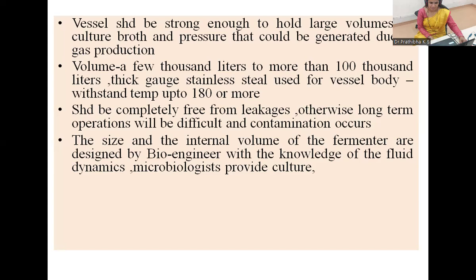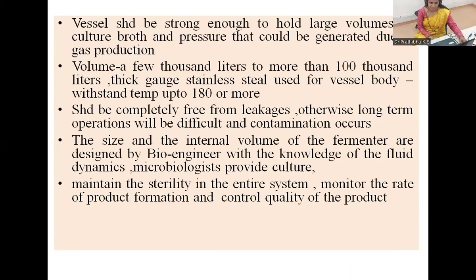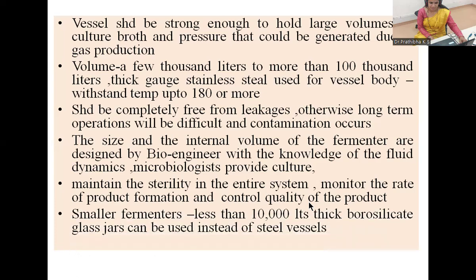The fermenter is always designed in such a way that, for product formation, enough space is given apart from the culture medium and the inoculum. In the fermenter vessel, maintaining sterility in the entire system is very, very important. Aseptic conditions are a must, and the fermenter vessel must be devoid of any kind of contamination. Monitoring the rate of product formation and controlling the quality of the product is very, very important.